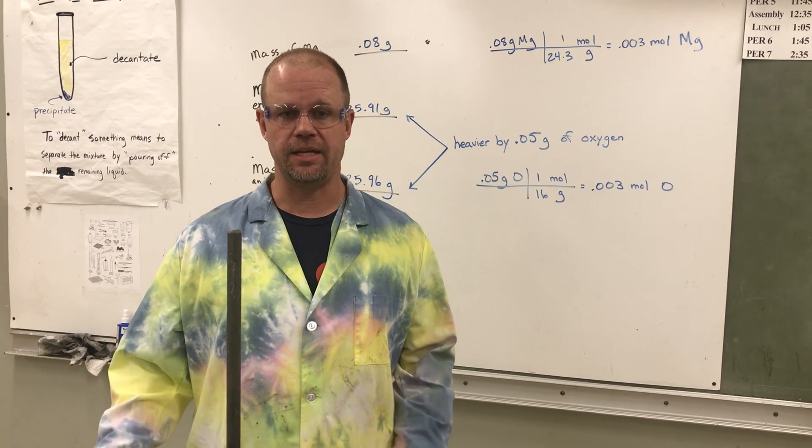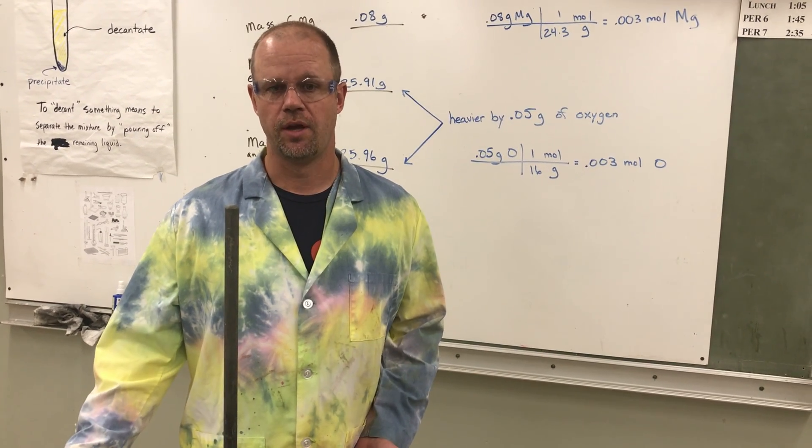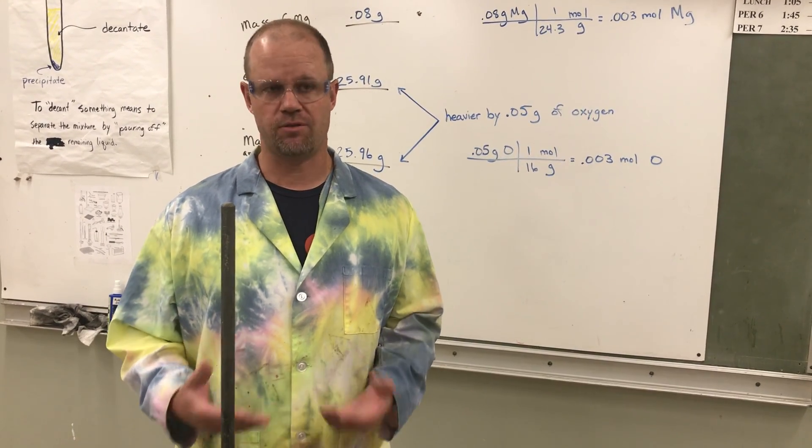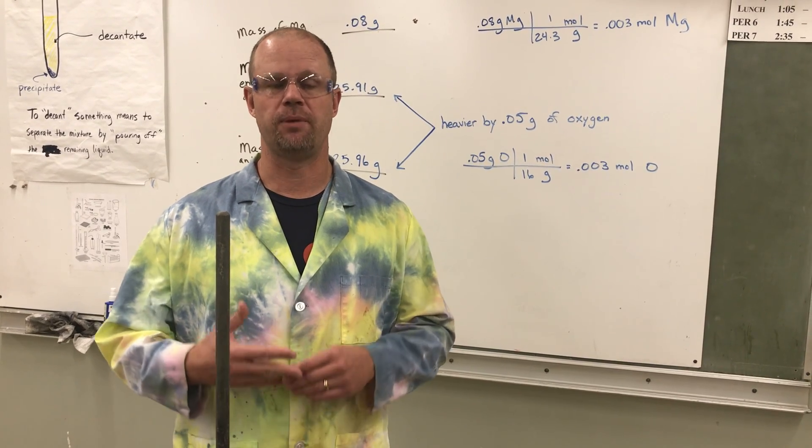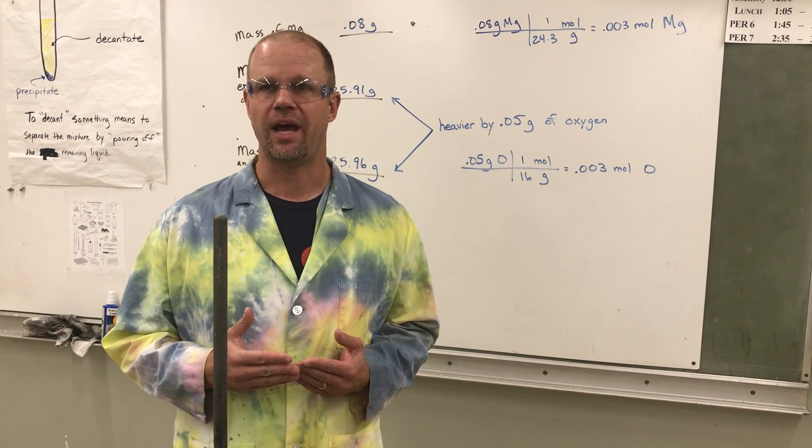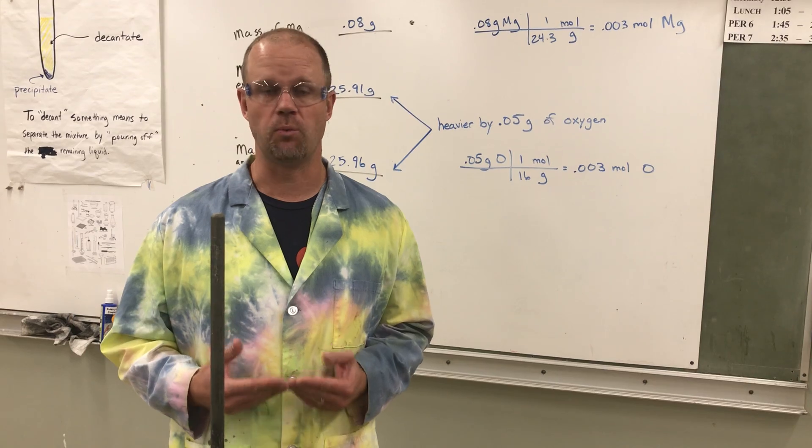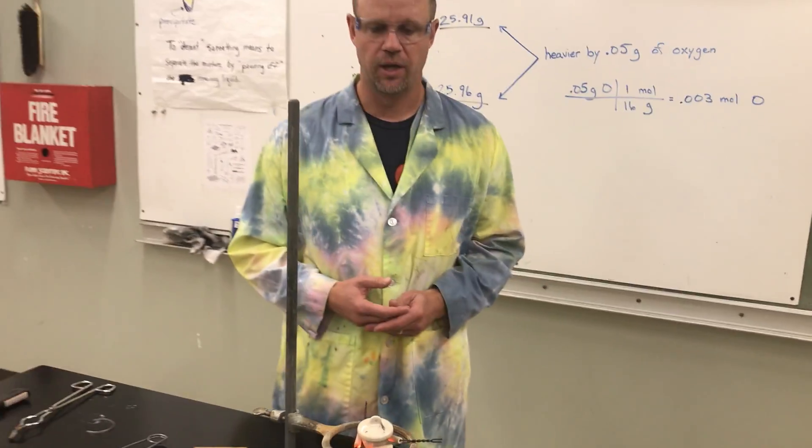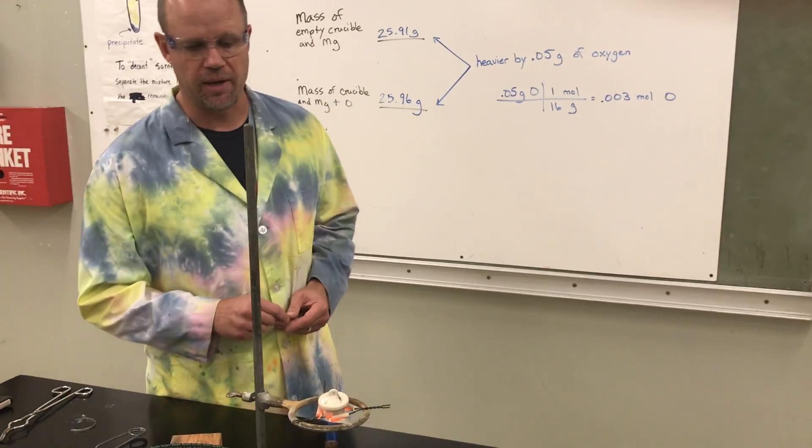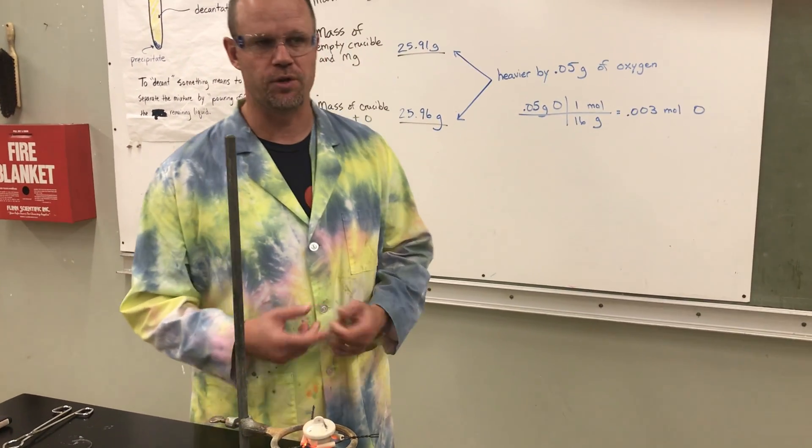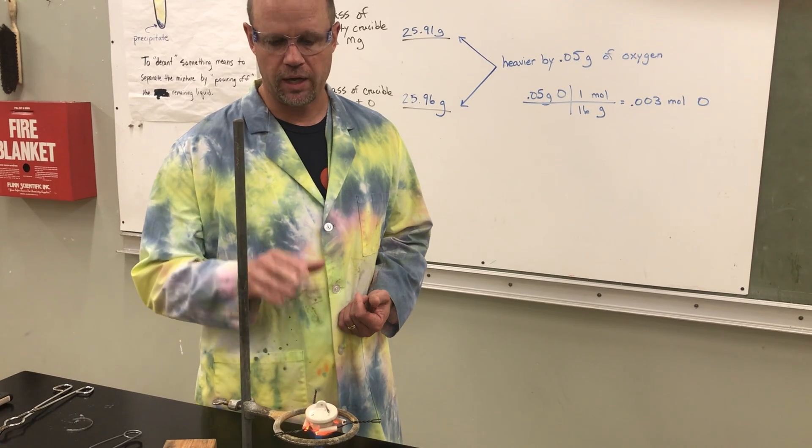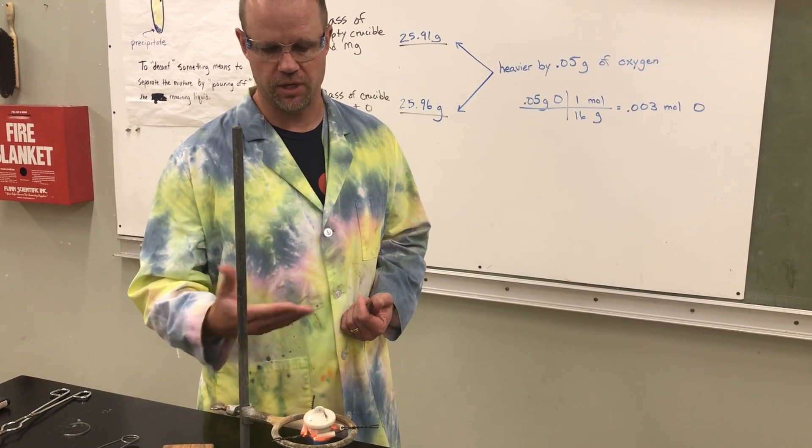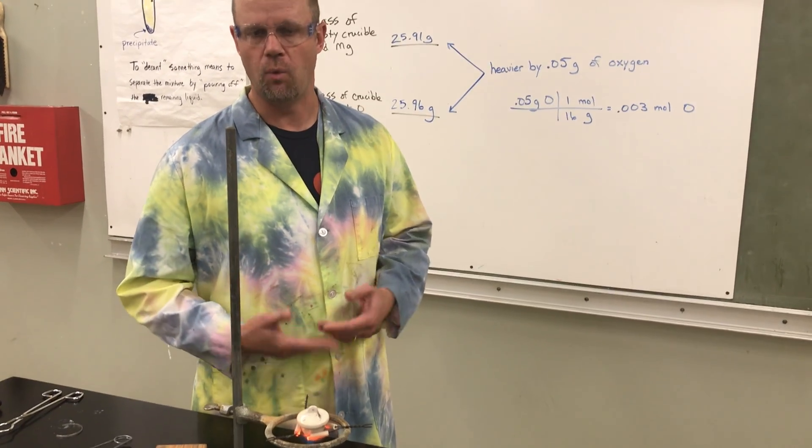Now, this is kind of a complicated idea and something that's hard to put into words, but we're going to look at some amounts from a reaction, and I just want you to get the big picture of why we need to have some specific measurements in chemistry and what it can show us. Right now we've got a reaction going in this little thing called a crucible, and right now we have a piece of magnesium metal inside that crucible. We're trying to force it to react with oxygen. I just have to heat it up for a while, so it's going to sit here and cook while I'm talking.